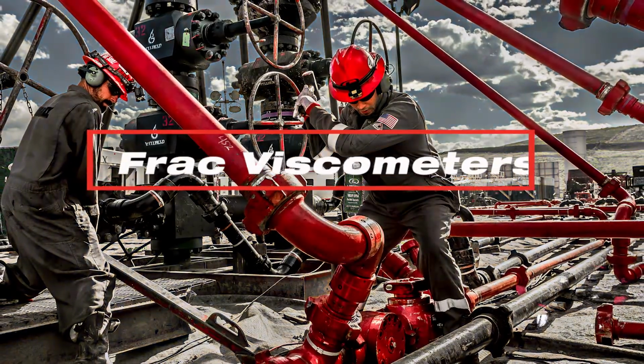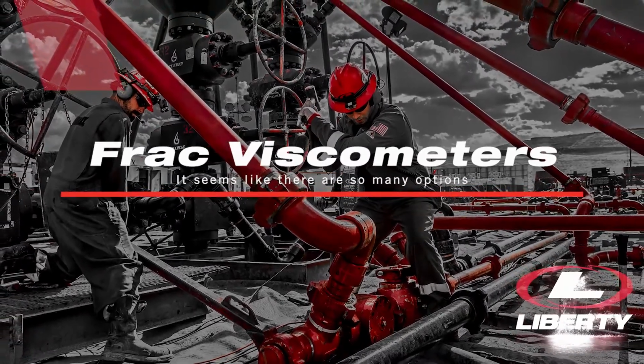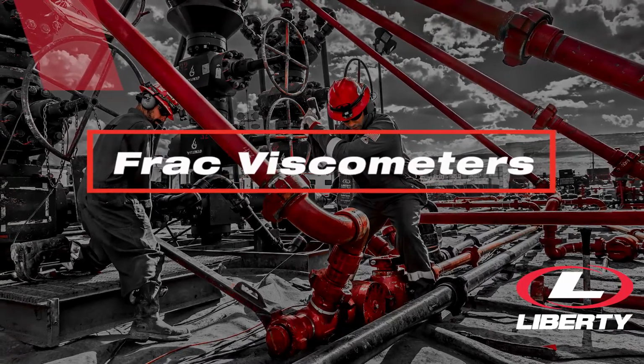Today I'm going to talk about some specific tools that we use in our labs called viscometers or rheometers. We use these instruments to design our fluids and also to ensure that our frac fluids behave as designed. To understand what these tools do for us, let me back up and talk about rheology.